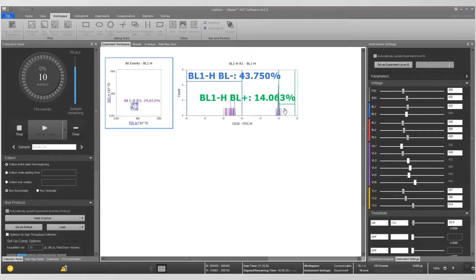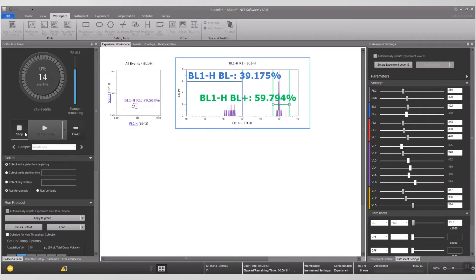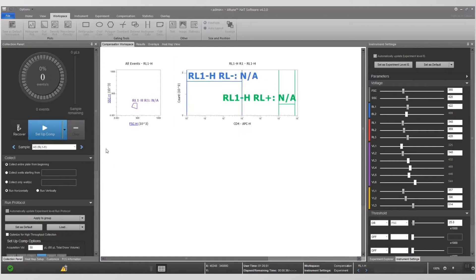Adjust the fluorescent channels until the positives are on scale and not off the plot towards the right, and adjust the gates. When adjustments are complete, press the stop button. Do not record until all voltages have been adjusted. Click the arrow in the control panel to advance to the next well. Repeat for CD4 APC, then repeat for all remaining single color controls.